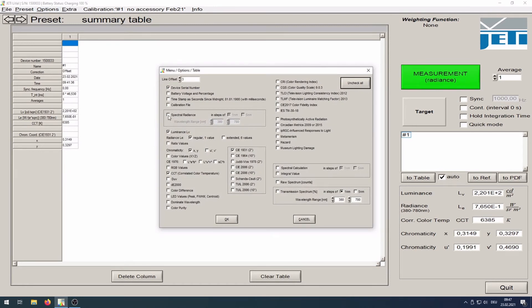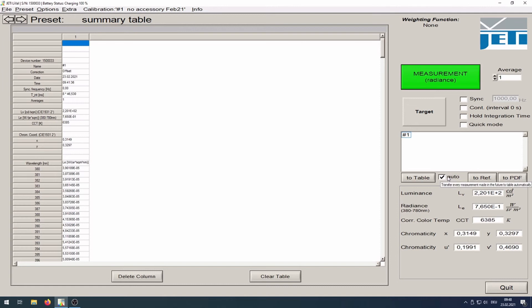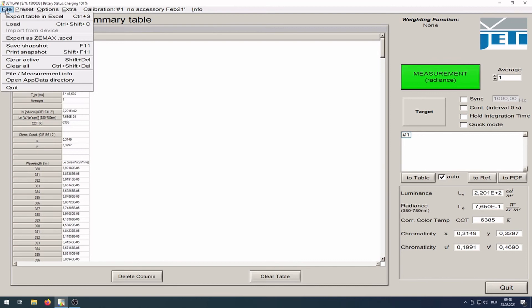Click OK to finish. If you select to table, the values of a single measurement will transfer to the table. Otherwise, if you want to save the complete results of all the measurements of a session, click AUTO to export the data to Excel.